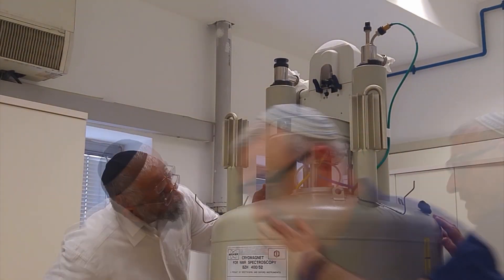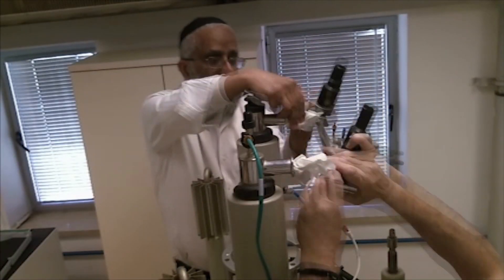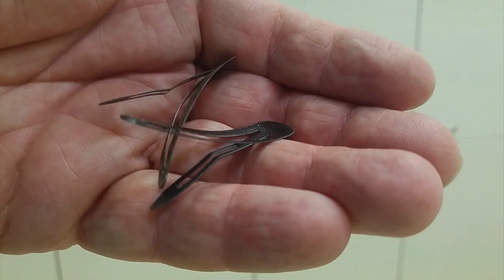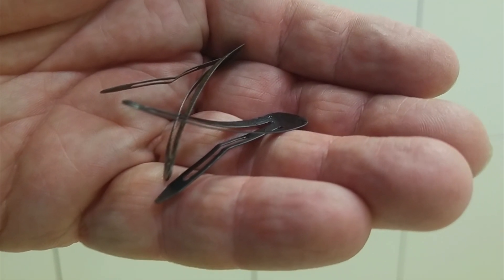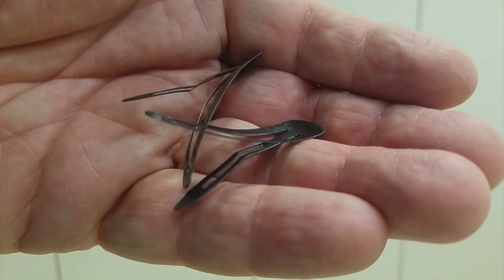The sample changer can now be unscrewed and lifted off. To minimize contamination by air, we replace the helium bridge. Before opening the bore, one should remove any magnetic clothing that could conceivably fly into the bore, such as Yarmulke clips. They are really difficult to get out and could destroy the magnet if they get in.